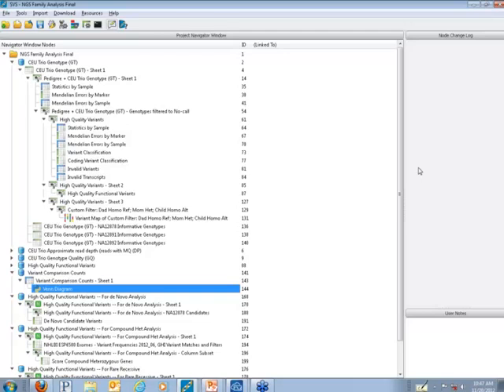How does the RNA-Seq package integrate with my EA pipeline? The output of the EA pipeline is the tabularized quantification output that can be, again, directly imported into SVS, and quality assurance measures can be performed directly on that, and analysis can be run on that as well. So again, the output of the EA pipeline directly goes into SVS for analysis.